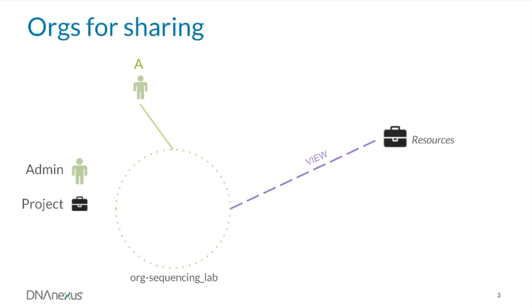User A, as the org admin, has the ability to add users to the org. By adding users B and C to the org, user A is giving these users permissions to all projects that are shared with the org. In this case, users B and C now have view permissions to the Resources project.